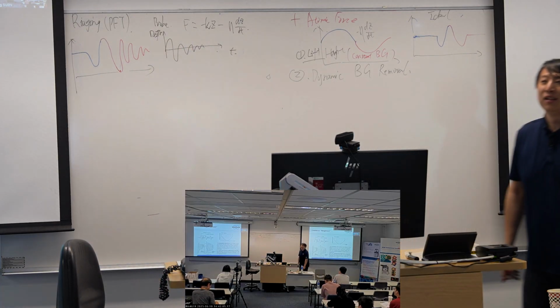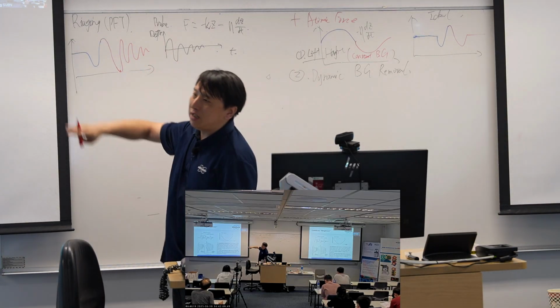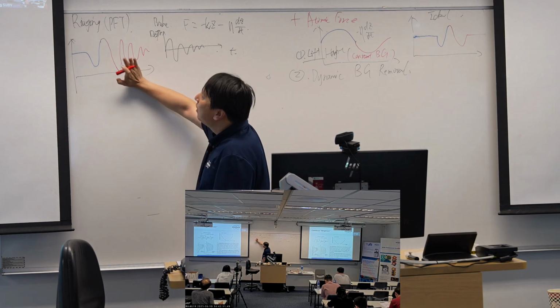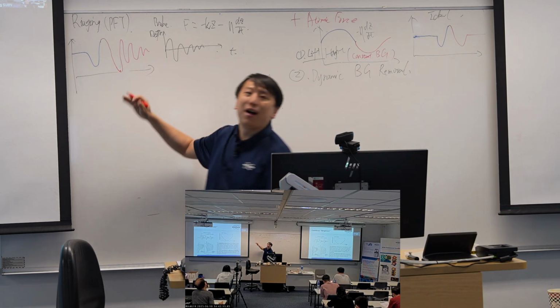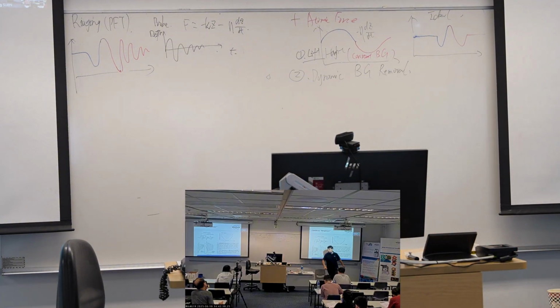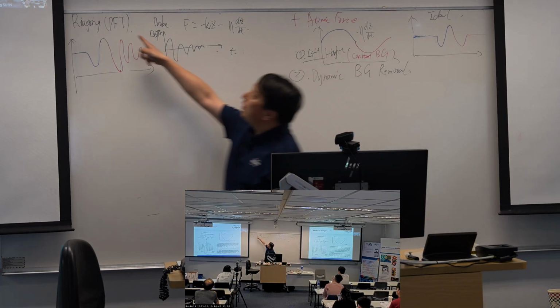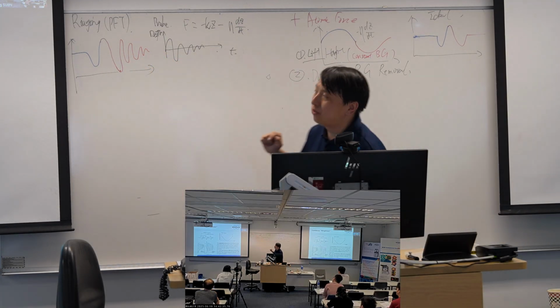And this will be easily observed in PeakForce Tapping because we do this force curve in a very fast way. Just like if you bend it slowly, the oscillation will stop quite fast. But if you do it in this fast way, you can see this damping. So that's the origin of this ringing.